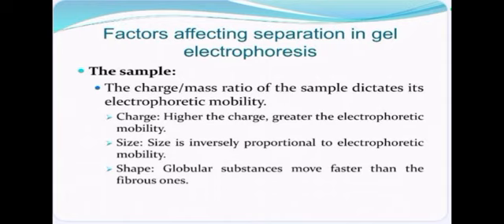Next, sample size. The size is inversely proportional to electrophoretic mobility. So sample size affects gel electrophoresis. Next, sample shape. Globular substances move faster than fibrous ones. So the sample affects gel electrophoresis.